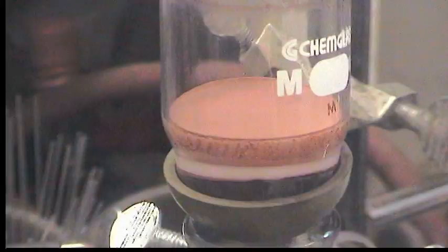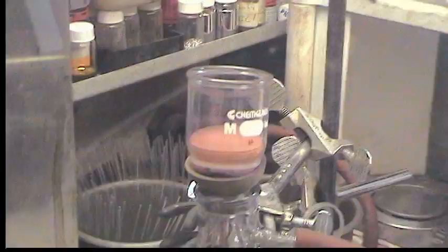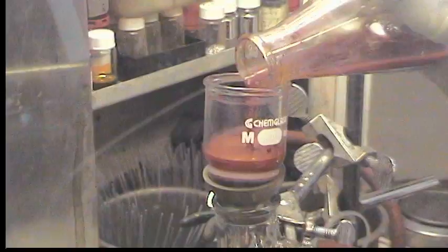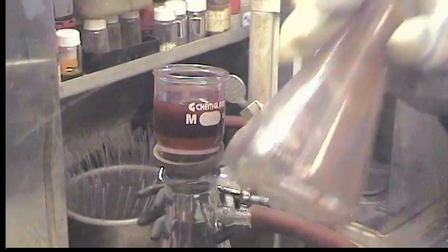So that's the product and we're going to wash it twice with THF, maybe three times, we'll see. Get rid of all that purple stuff. And also tin dichloride has solubility in THF.